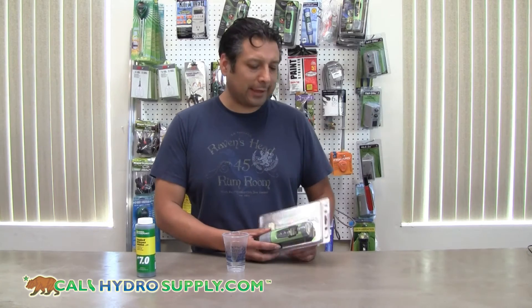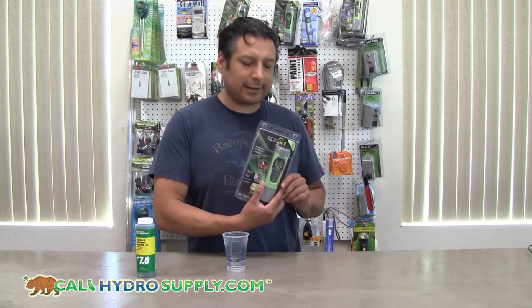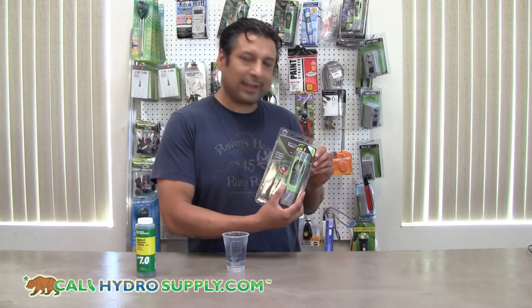Hi, you're tuned in to Cali Hydro Supply and today we're going to learn how to calibrate an Eco PH1 tester.